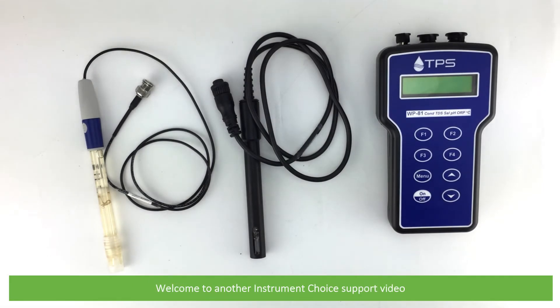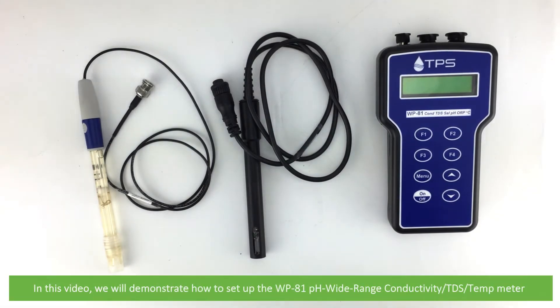Hi and welcome to another Instrument Choice support video. In this video we'll demonstrate how to set up the WP-81 pH, wide range, conductivity, TDS and temperature meter.